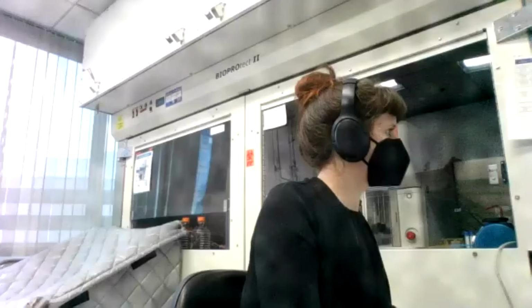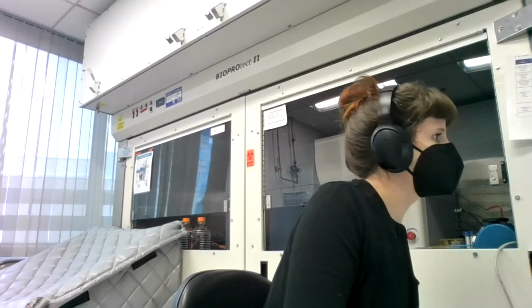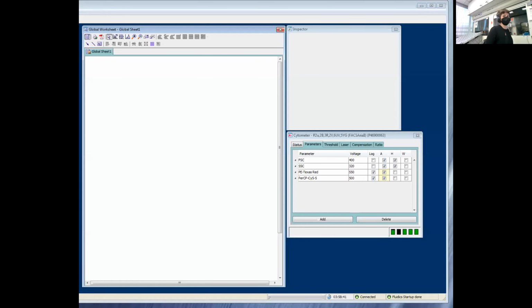Sounds good. Thank you so much, Derek. Let me make sure I'm sharing the right screen. And I can see I'm on two different computers today, so I can see it's sharing, which is great. And now we're ready to, perfect. Thank you. So now we're ready to go ahead and look at the practical run of DNA analysis by flow cytometry. So again, I just want to thank Hwan Chong from Ian Cheeseman's lab here at the Whitehead, who is kind enough to provide these samples for us today.